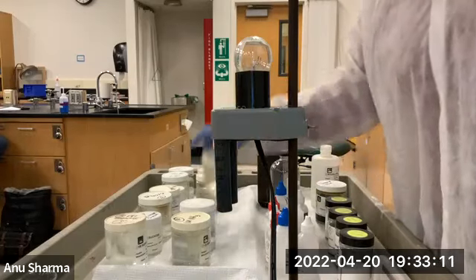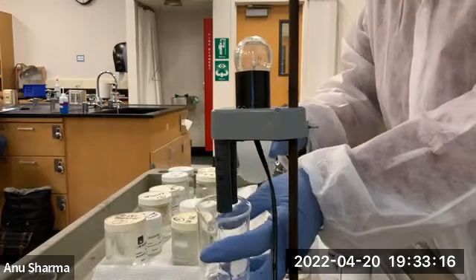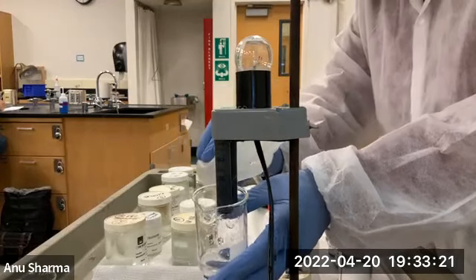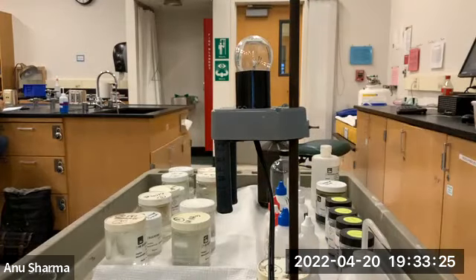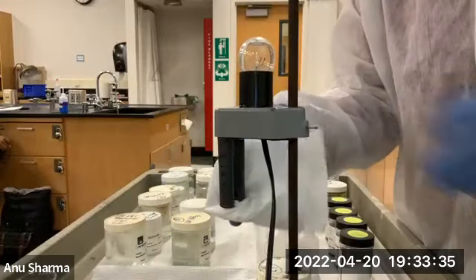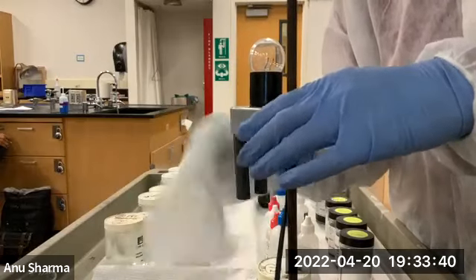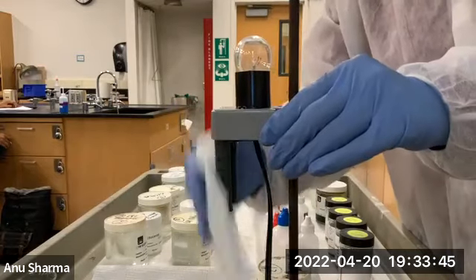Now comes the sulfuric acid, very strong acid. Be very careful with that. Washing this all the time, so there is no residual. All right, so it's like this.